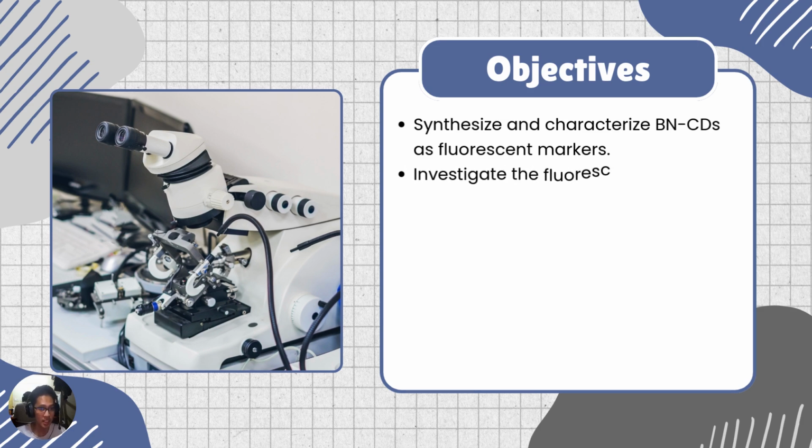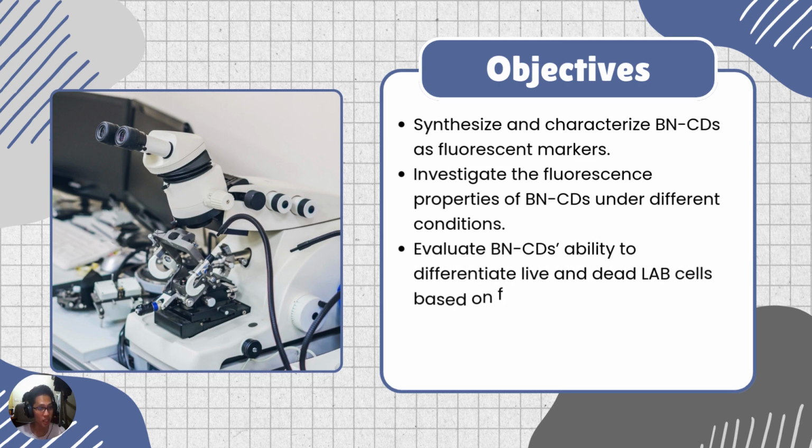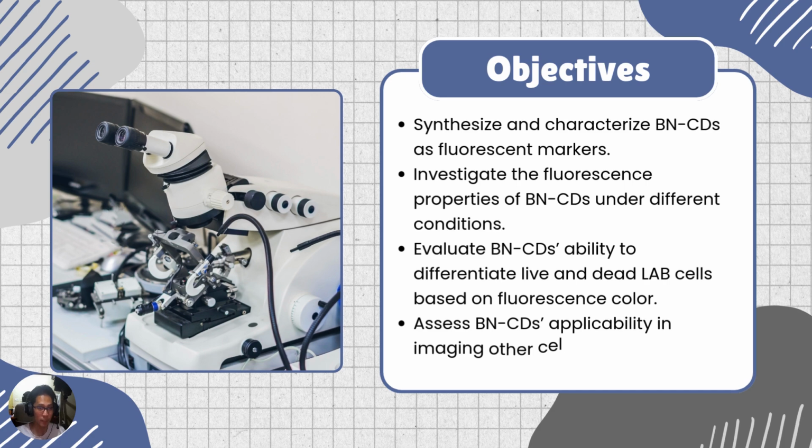First, synthesize and characterize BNCDs as fluorescent markers. Second, investigate the fluorescence properties of BNCDs under different conditions. Third, evaluate BNCD's ability to differentiate live and dead LAB cells based on fluorescence color. And lastly, assess BNCD's applicability in imaging other cell types beyond LAB.